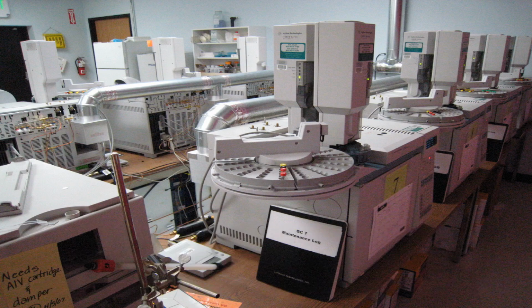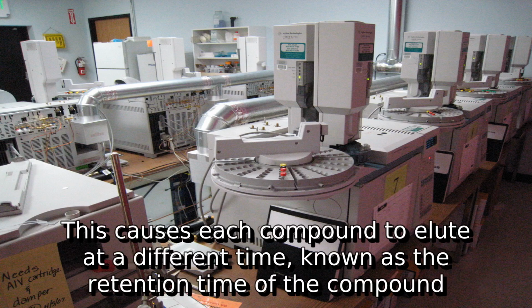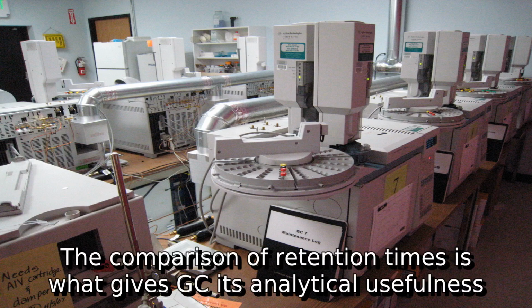Gas separator. The gaseous compounds being analyzed interact with the walls of the column, which is coated with a stationary phase. This causes each compound to elute at a different time, known as the retention time of the compound. The comparison of retention times is what gives GC its analytical usefulness.